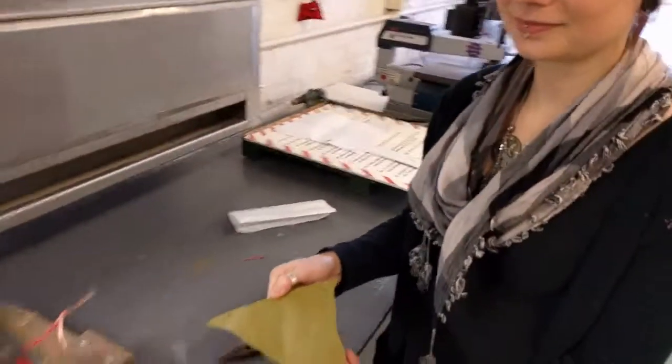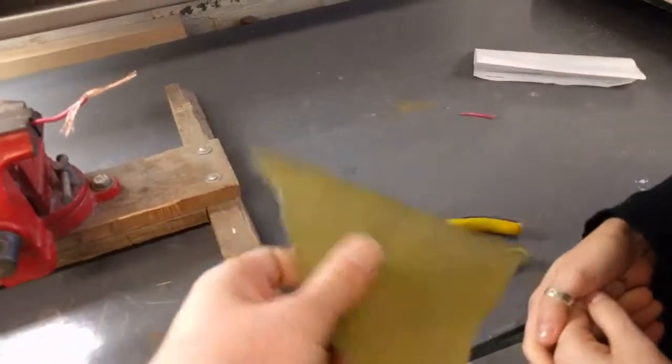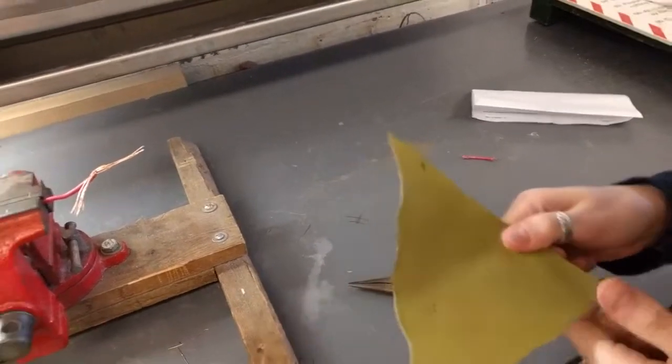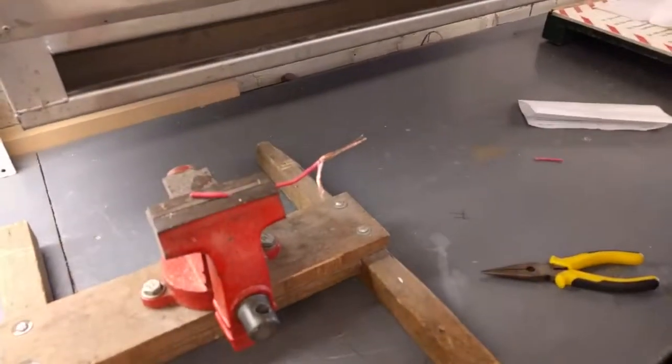So we have mystery leather that Max has a ton of, and we wanted to see — it looks pretty plastic-coated, it's kind of shiny, it feels plasticky — so we figured, I don't know if we want to laser that. And then we have this other leather that looks a little bit more natural, so we're going to test it on here.